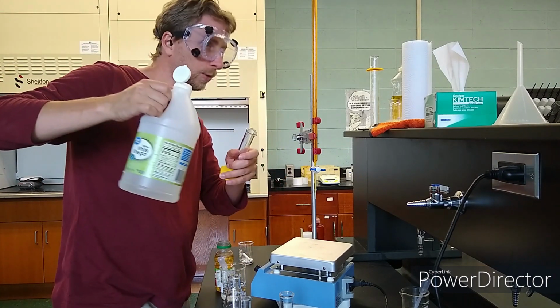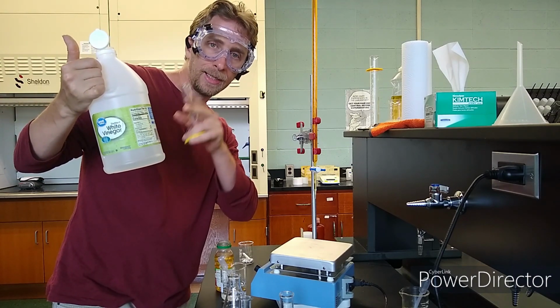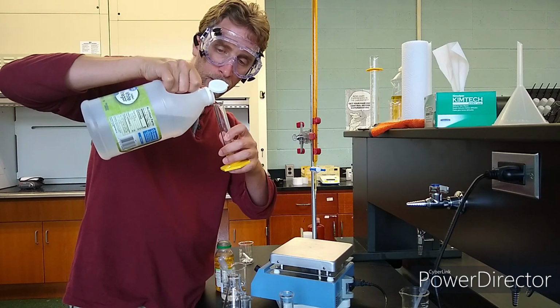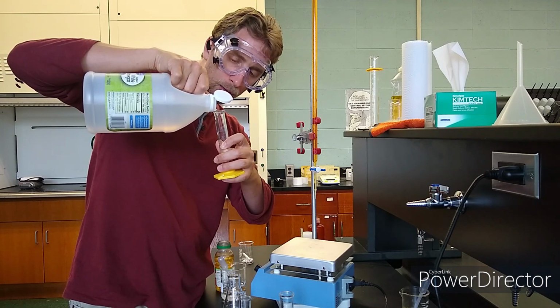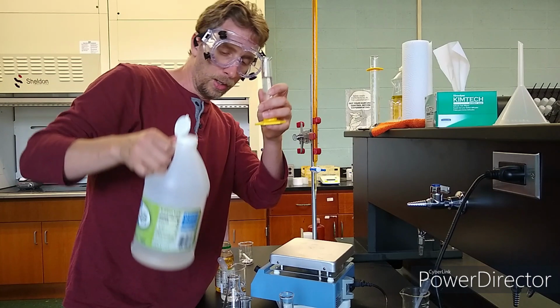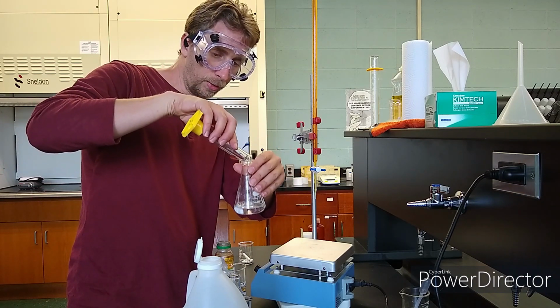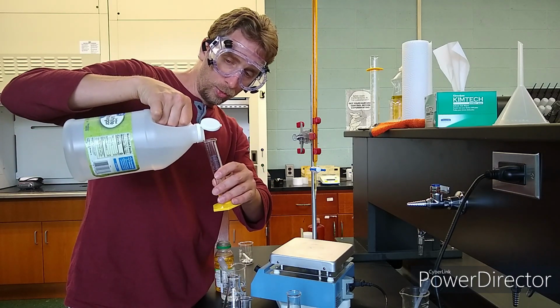So it says 25 milliliters of ascorbic acid. I'm sorry, 25 milliliters of a 5% acetic acid solution. Vinegar is acetic acid. It's 5% when you buy distilled white vinegar from the grocery store. So 25 milliliters of that. Now, you don't have to be super precise on the vinegar because we're not trying to measure the vinegar. We're trying to measure ascorbic acid through this whole procedure. So that should be good enough on the vinegar. Some in there, 25 milliliters. Now, we're going to do this at least twice and see if we get good results from 2 trials.